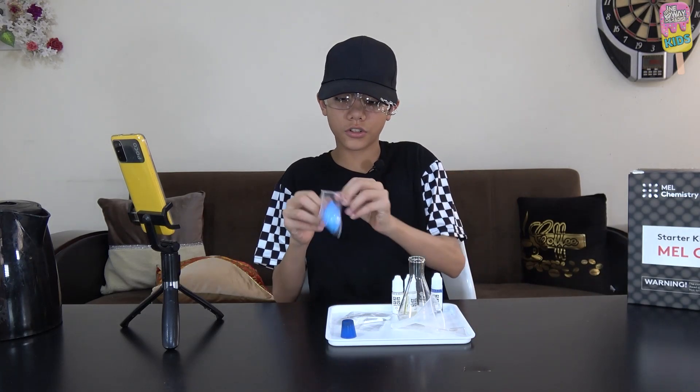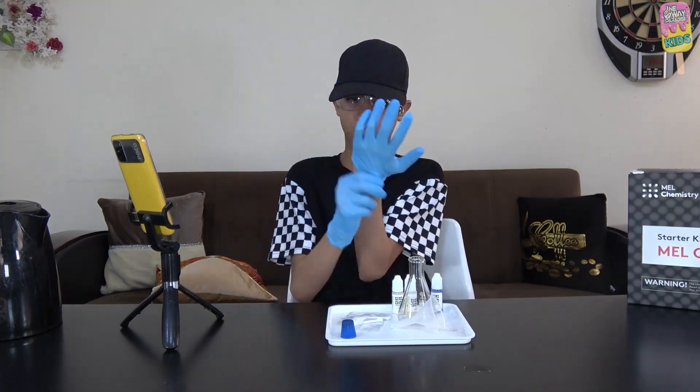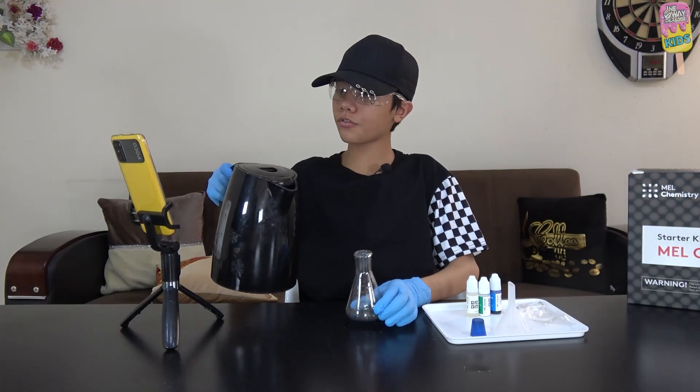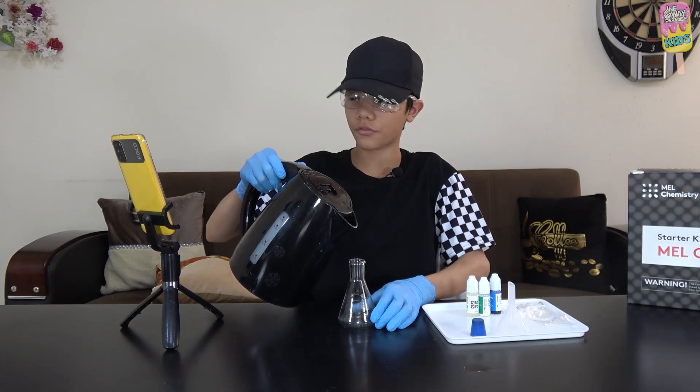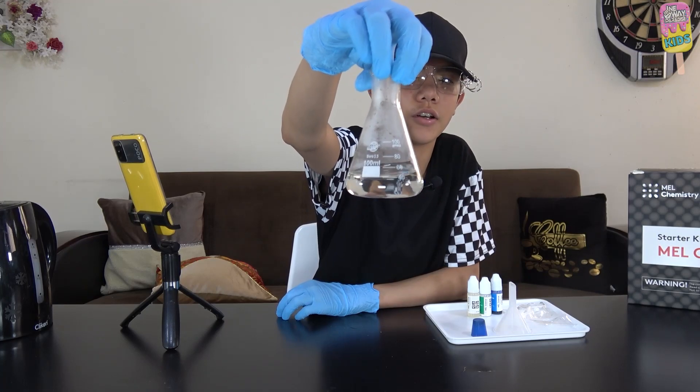Now let's start. I'll put on my gloves first. Then I'll fill the flask approximately a quarter full of warm water — this is very hot water.